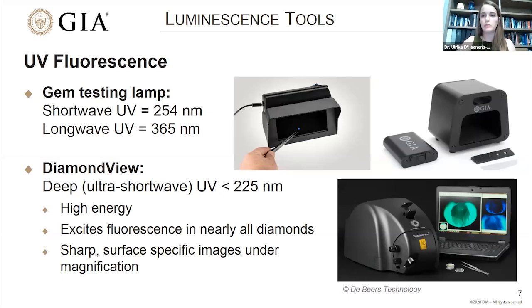Also, the images that you'd be able to collect are going to be very sharp and very surface specific. So you get very, very detailed images of these growth zones that we'll be going through. We'll give you examples of responses to shortwave, longwave, and deep UV in the next few slides.